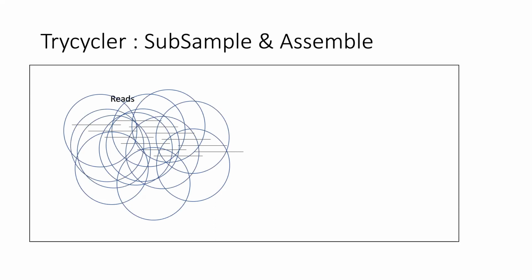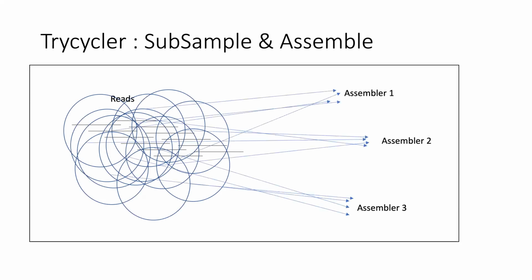In theory, there are 12, and then they go to different assemblers, like assembler 1, assembler 2, assembler 3. It doesn't necessarily matter at the moment which assembler you use. Use your favorite ones that you think are the best for your purposes. So in the Nextflow workflow that I'm creating, I've got Miniasm, Flye, and Raven. They don't necessarily have to be your favorite though.